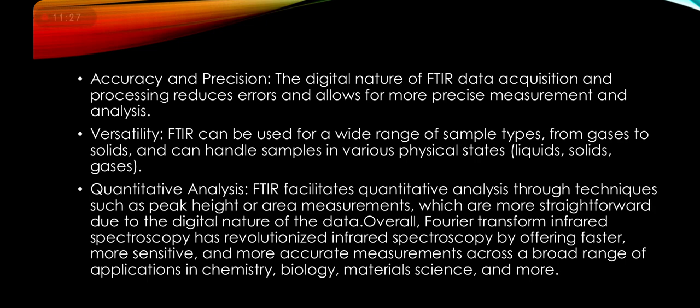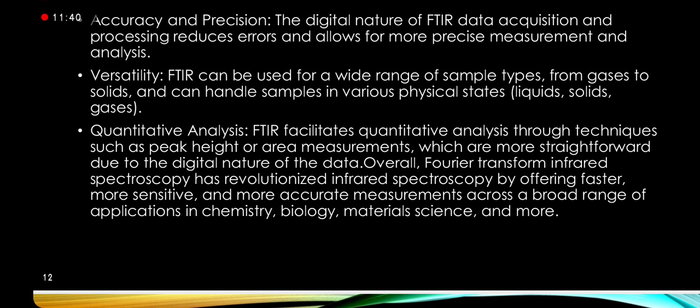Versatility. FTIR can be used for a wide range of sample types, from gaseous to solid, and can handle samples in various physical states like liquid, solid and gases. Quantitative analysis. FTIR facilitates quantitative analysis through techniques such as peak height or area measurement, which are more straightforward due to the digital nature of the data.